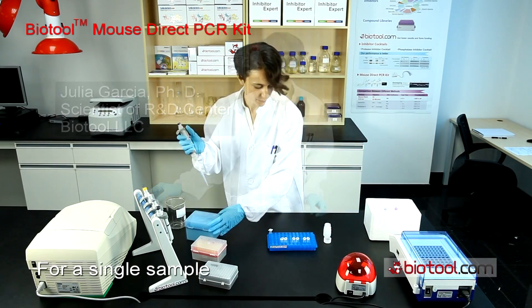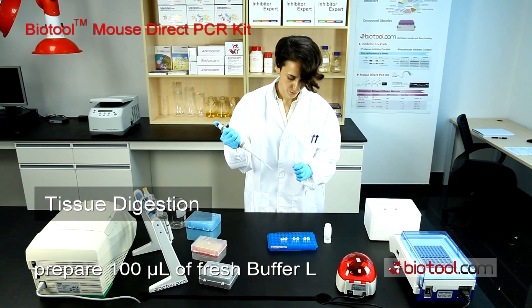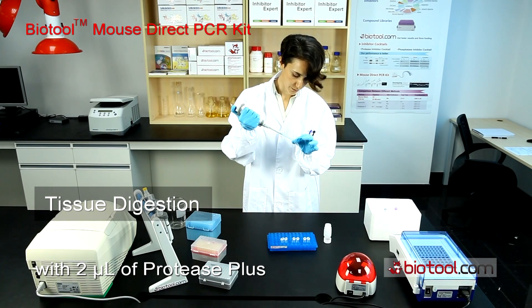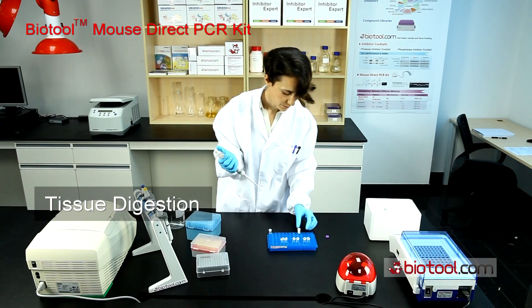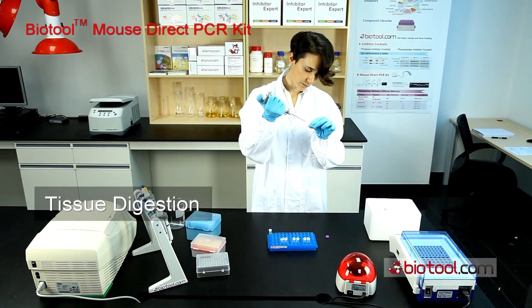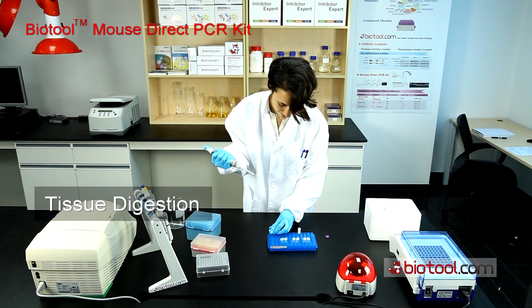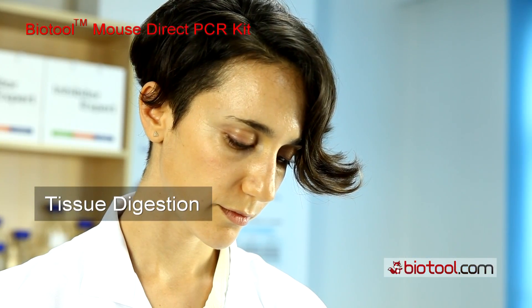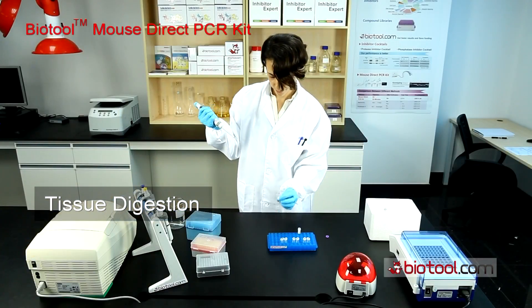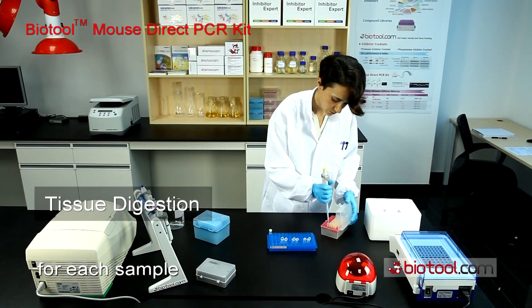For a single sample, prepare 100 microliters of fresh buffer L with 2 microliters of protease plus. You can also prepare a mixture and then make aliquots for each sample.